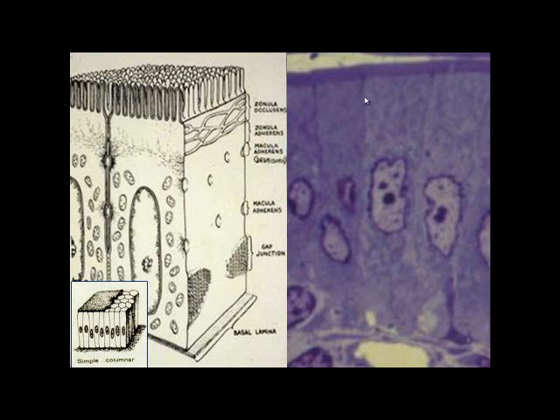So where one cell touches another cell, we see a terminal bar. Those are terminal bars right in through there, but it's not a bar itself. It actually goes all the way around the cell, as we will see later. So these are the terminal bars. We see one right here very nicely up through there and there. They prevent things from coming through and, in fact, facilitate the production of a lumen.